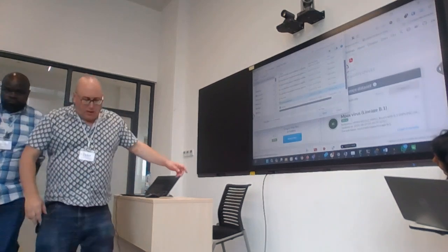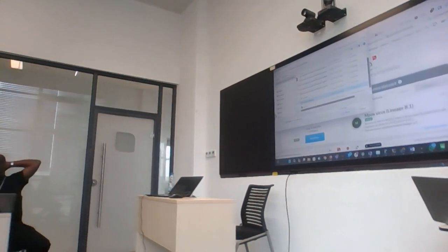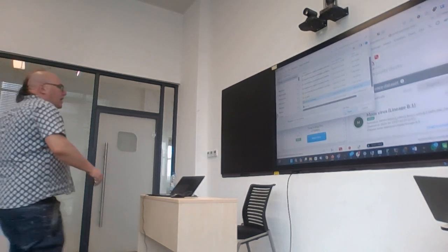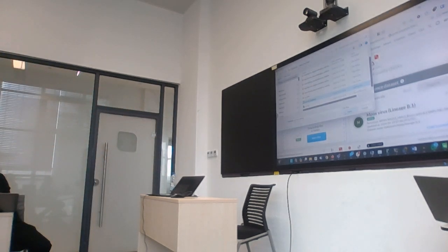You see, it says run1.allconsensus because I said that the prefix for my file should be run1. If you chose a different prefix name, your files would be called something else. Okay? So if you make your prefix 1, then it will be called 1, etc. Okay? And run1 all consensus is a FASTA file of the consensus for this one sample.